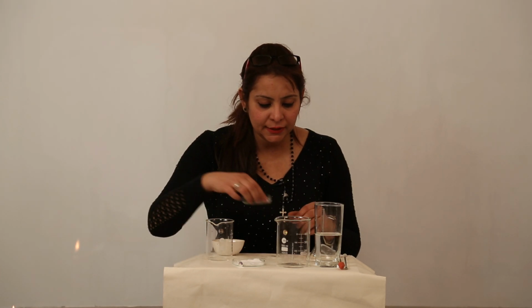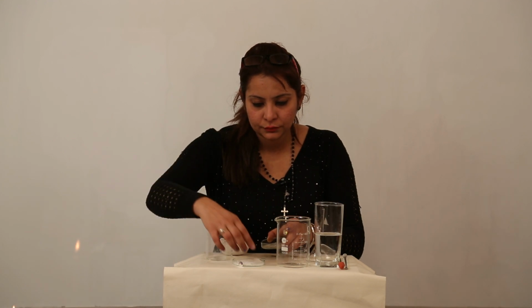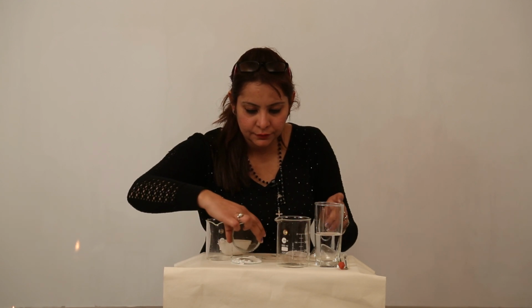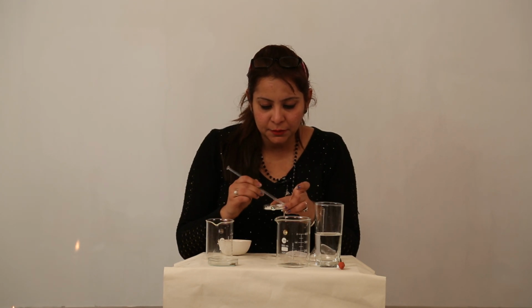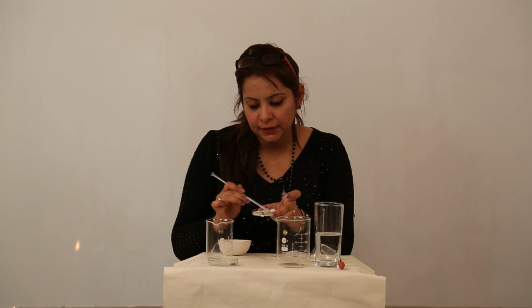So I am just mixing these two solids into each other like this, because now it has become a mixture of two solids, salt and of course sand. You can see it is getting mixed.